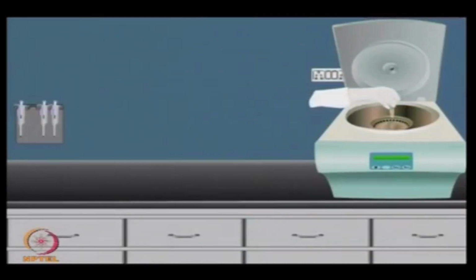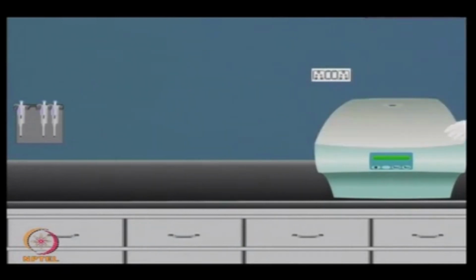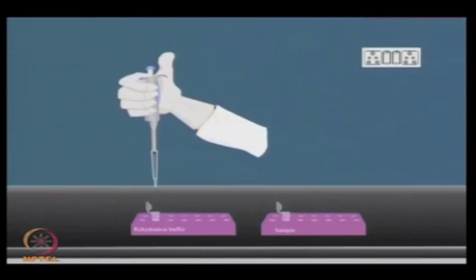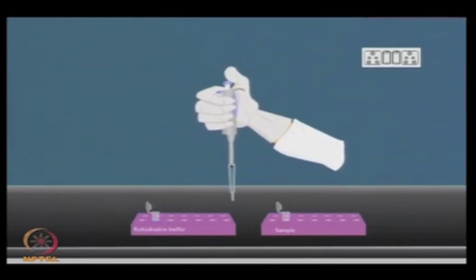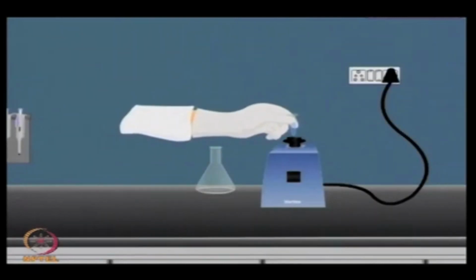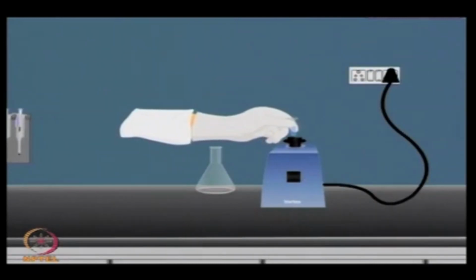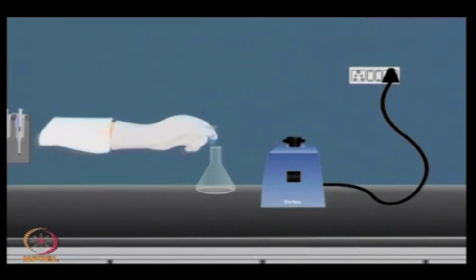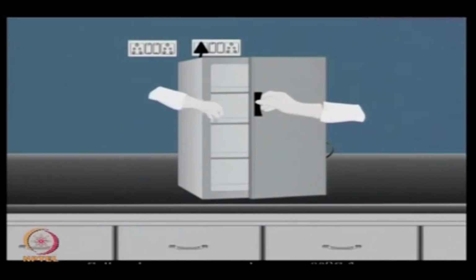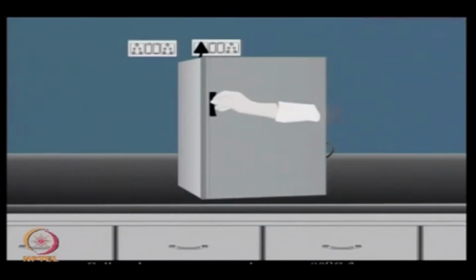Once the serum has been processed using a depletion column, precipitate out the remaining proteins by using trichloroacetic acid and acetone. Once the protein extraction is done, then we need to add the rehydration buffer, which contains urea, thiourea, CHAPS, DTT and BPB. After overnight incubation, then we can centrifuge and collect the supernatant.